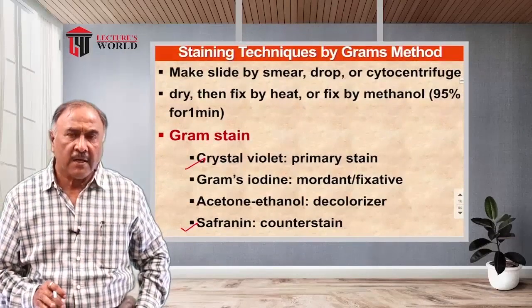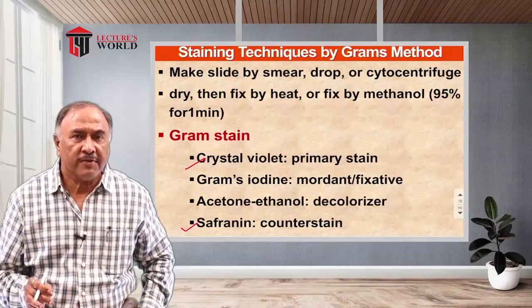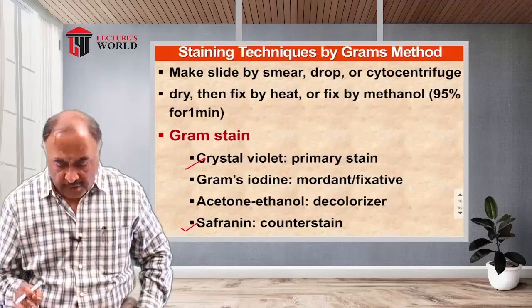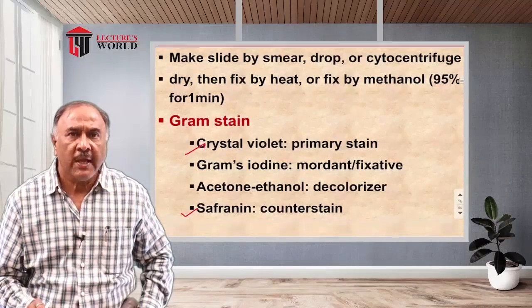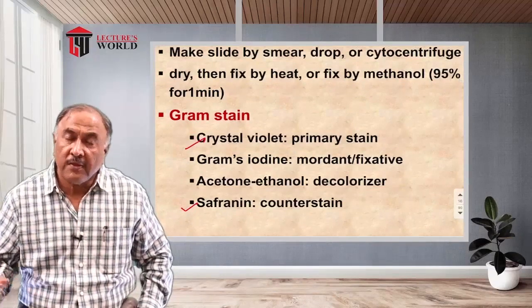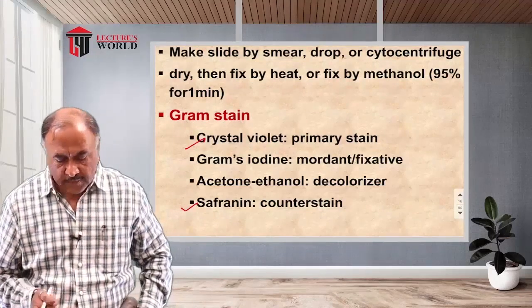Gram staining is a basic technique used in the microbiology lab for differentiating organisms into gram positive and gram negative ones. This tentative or preliminary identification also helps us select which kind of media we will use in the second part of the procedure, cultivating the organisms.